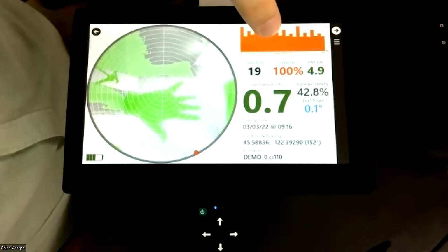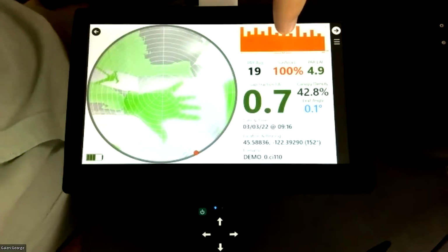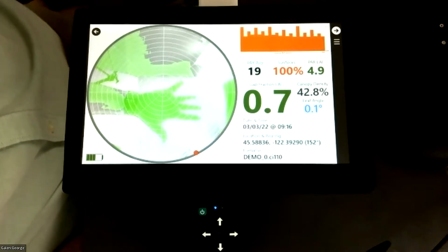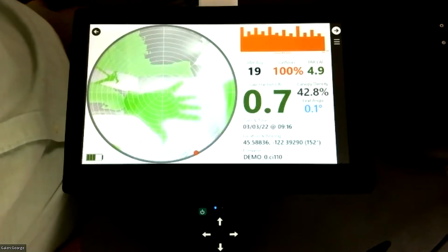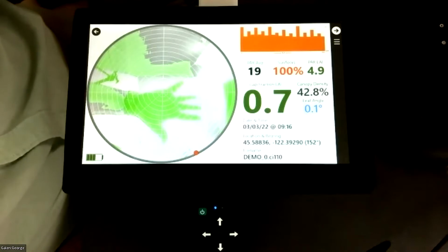We can talk about this in a little bit when I talk about the next menu structure. It's really determined by what the user wants to define it as. It is a parameter that is not necessarily direct sunlight, like an open sky in the canopy, but it's an incidence of light getting through the canopy in a short period of time.